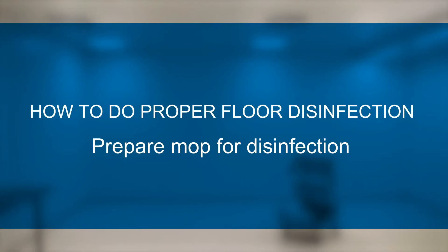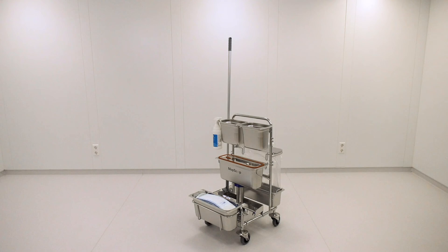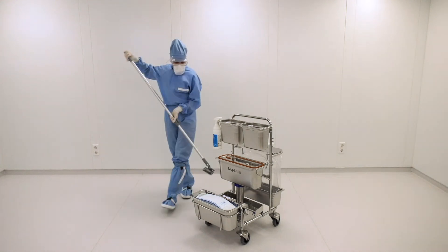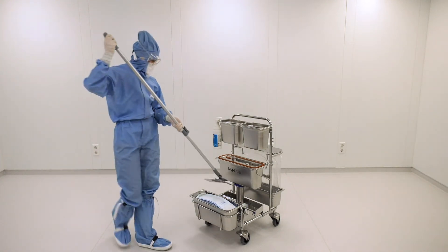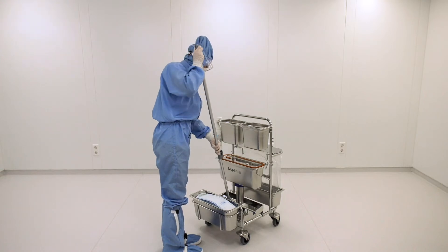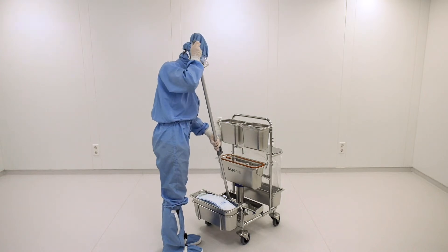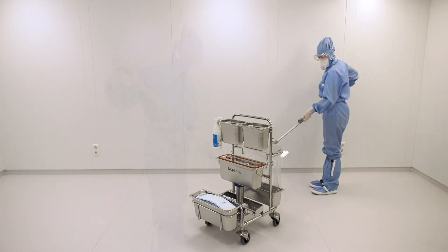If possible, place your cleaning trolley so that you do not have to move it much, if at all. In this example, a precise dosing system is used to prepare the mop covers on demand. First, you use your mop frame to activate the dosing system.